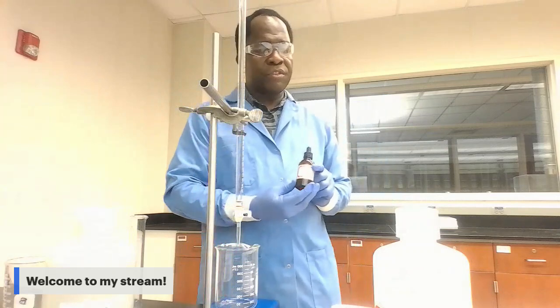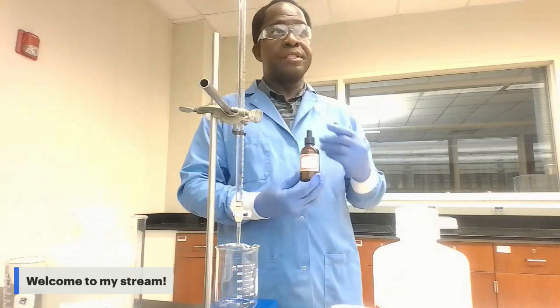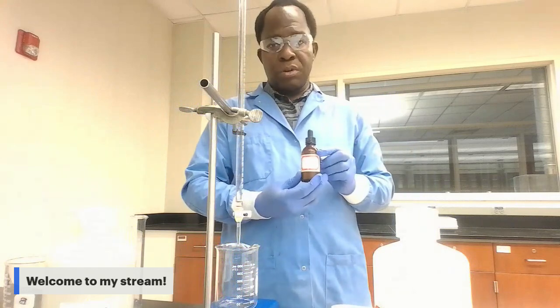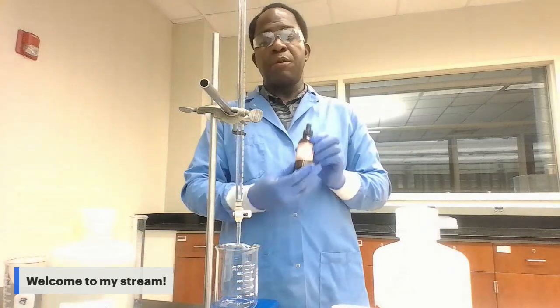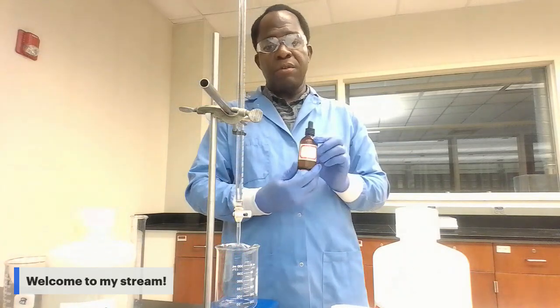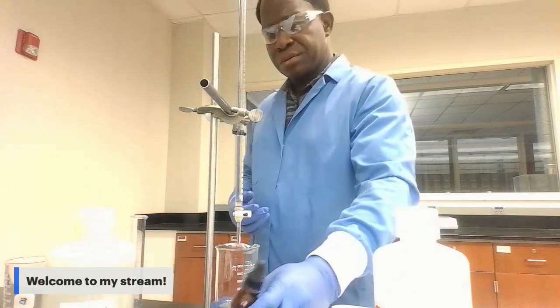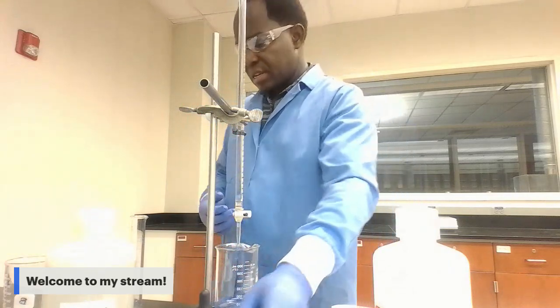The role of the phenolphthalein is to let you know when you get to the equivalence point. It will give you a color change when you get to equivalence.